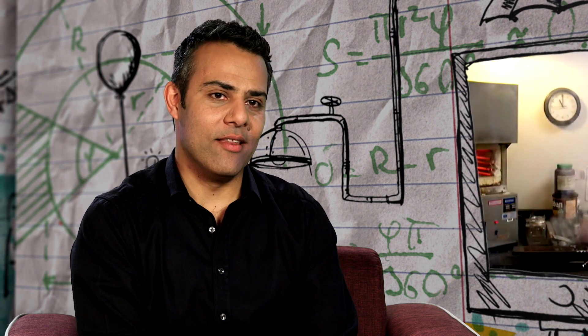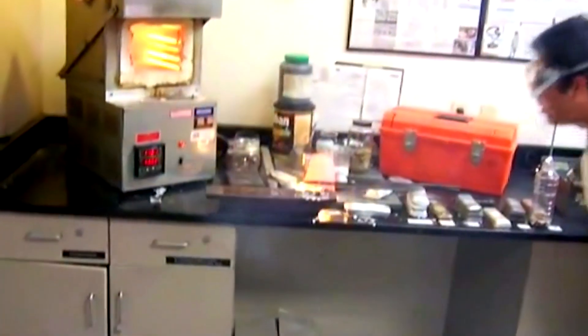I think you know you've failed when there's a hole burnt through your lab coat and the bench is on fire.